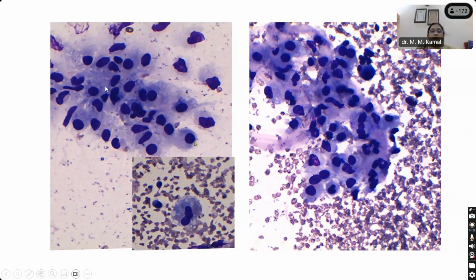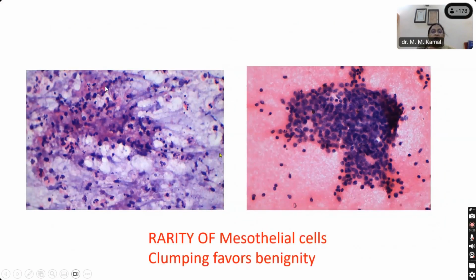Now here these are epithelioid cells. Yes, ma'am. When we say epithelial-like histiocytes, they are epithelioid cells. And classical epithelioid cells that you find in FNAC smears have a slipper-shaped nucleus. I've put it in the inset. And here you are seeing these epithelioid cell clusters. Now, any other cells you are able to see? What is this background that you are seeing over here?